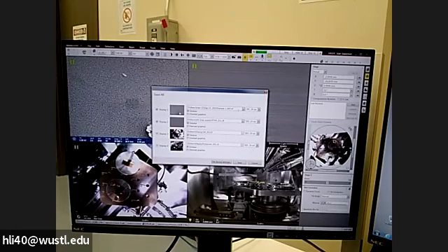After you set up this file name, if you want the second image, you can copy this file name to the second line. Just Ctrl+C, Ctrl+V, but don't forget to change the detector. Use the same location, just the detector is different. So this is CBS, so I put CBS there.